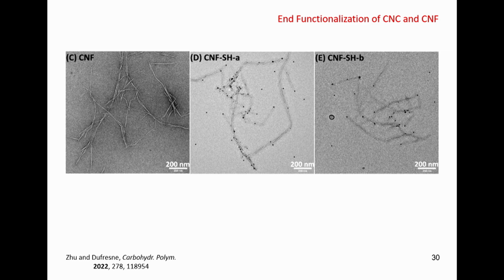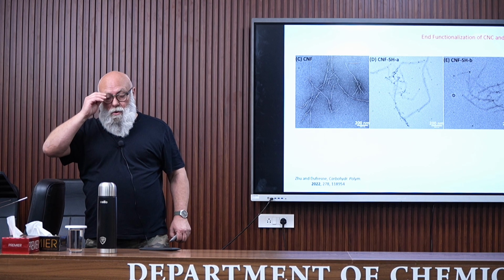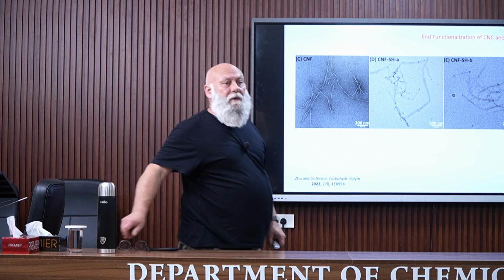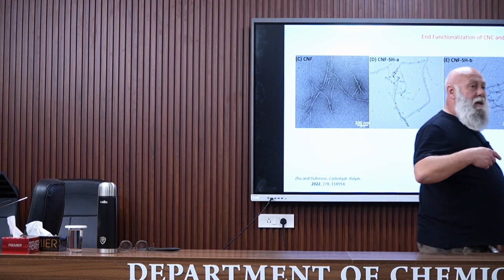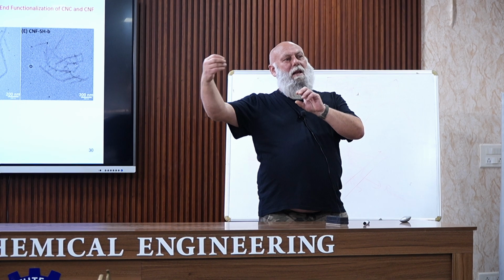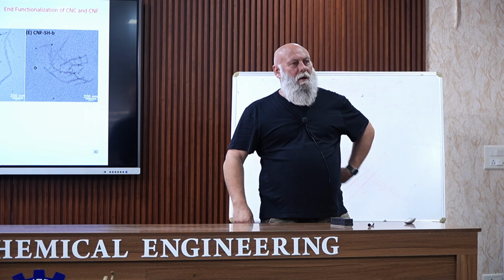It was in this case. It was one of my PhD students, Ge Zhu. He performed this chemical modification to mix the nanofibrils with natural rubber. And in fact, he grafted another molecule, I don't remember what, he was the chemist, so he can manage. He grafted another molecule at the end of the nanofibrils to cross-link the nanofibrils with the natural rubber.